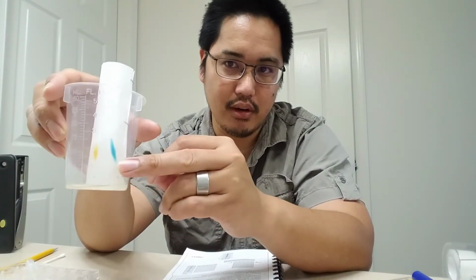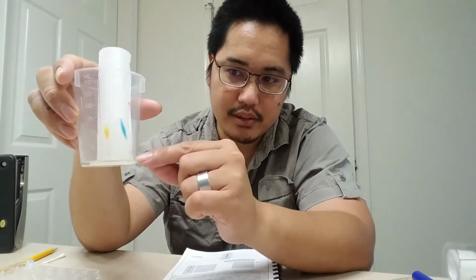For example, if you decide to measure the bottom of the dot, you see how this dot is really not a point, it's kind of a long streak. If you decide to measure from the bottom to that spot, then you're going to have to do that same kind of measurement from the bottom on each of them. But maybe the bottom might not be clear to you, or maybe the top might not be clear to you. Maybe you want to find an average. Well, make sure to do an average for all of them. Because I actually don't think that it says where to do it from. So I'll let you folks decide on what you want to do.